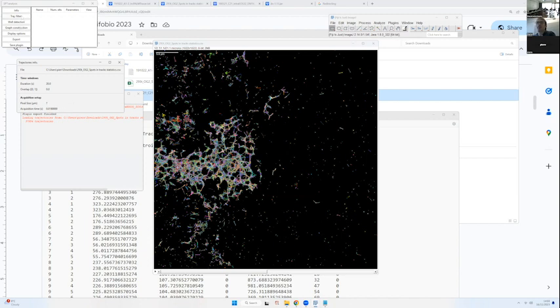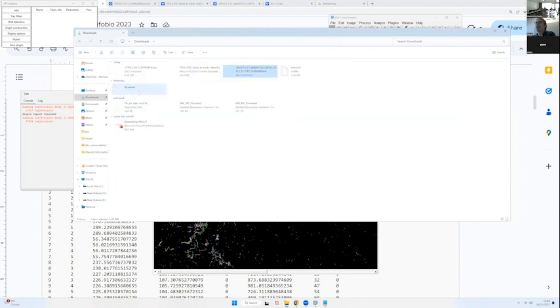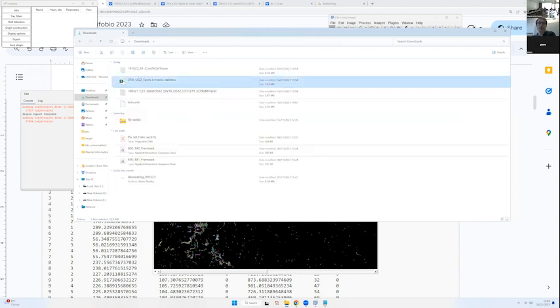So wait, everybody has this picture? No. So wait. So it's 293T OG2. Yeah, and we are in custom, right? What is the load from custom? No, it's TrackMate.